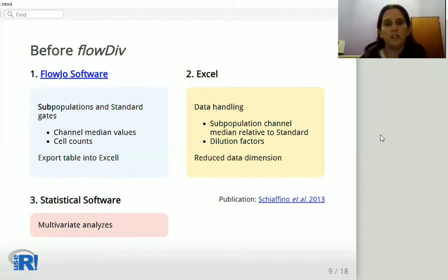We exported their channel median values and cell counts into Excel. Then data handling involved transforming the channel median values of each subpopulation into relative values according to the standard.